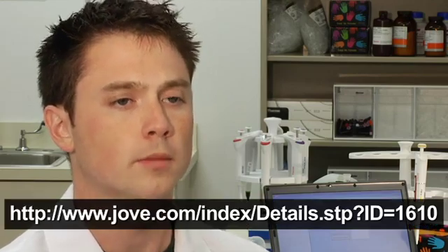Nanodrop microvolume instrumentation can determine nucleic acid concentration by either direct A260 measurements or indirect fluorometric methods. Nanodrop spectrophotometers can also be used to quantify proteins using direct A280 absorbance or by protein colorimetric assays.